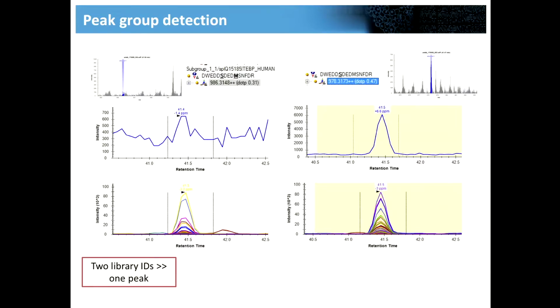This was the most intense peak, and this was selected because a lot of the transitions between the oxidized and phosphorylated and just phosphorylated, they will share a lot of the transitions. These 2 transitions will point to the same place, to the same peak in retention time, but of course will have a very different MS1 level score.